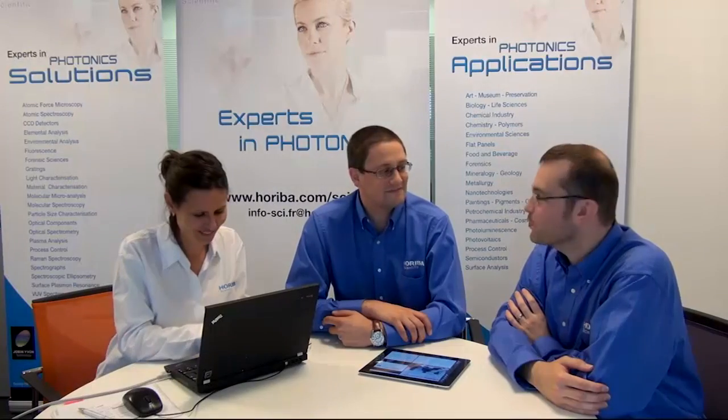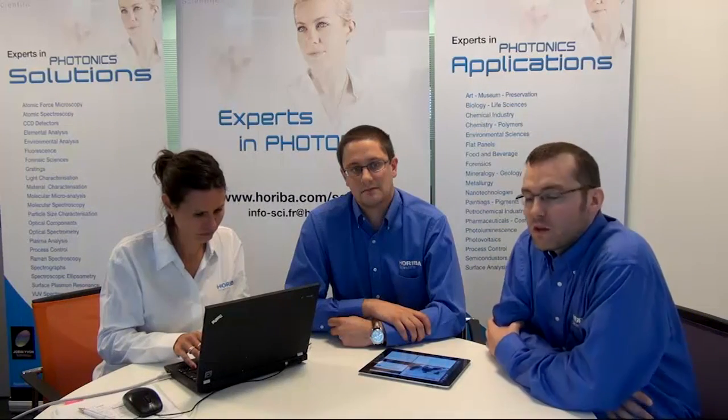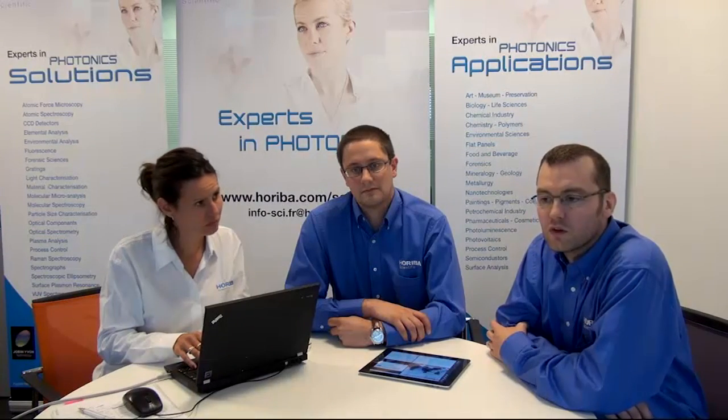What is the difference with an Aqualog? Big question. Almost none. For the moment, the Dual-FL is almost the same thing as the Aqualog. Again, we were discussing the accessories, and the accessories are similar. There will probably be more development on the Dual-FL in the future, but we are still thinking about it. From the purely hardware point of view, yes.